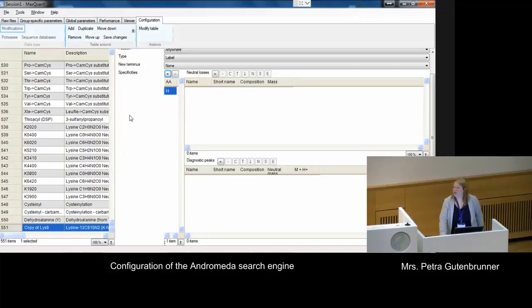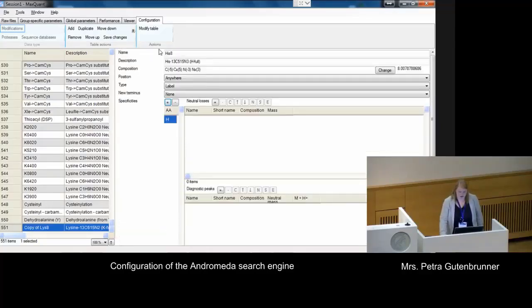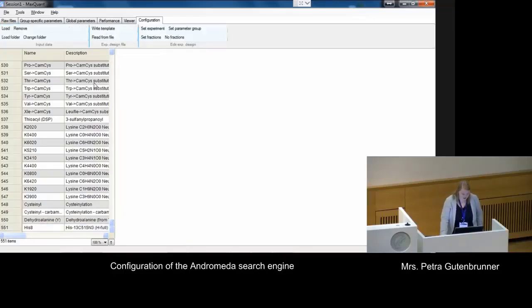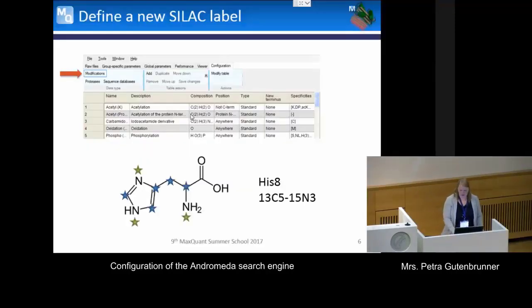So now we have done everything in order to add a new SILAC label. And then we have, as usual, what is important to click now. Exactly. Right, very nice. Okay, so let's go back and see what we have to do next.